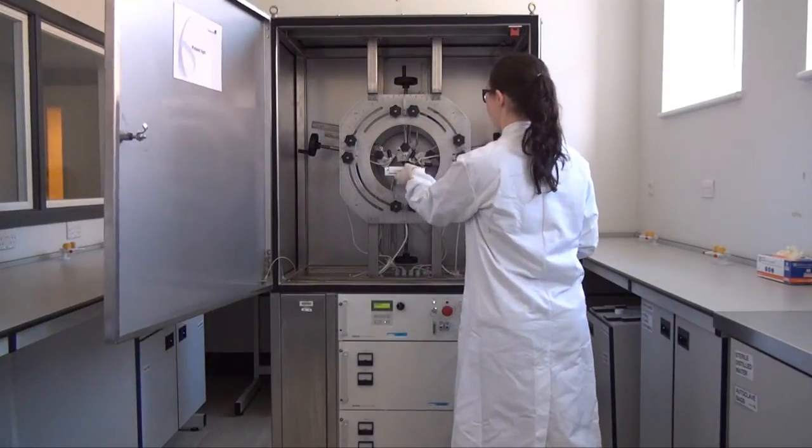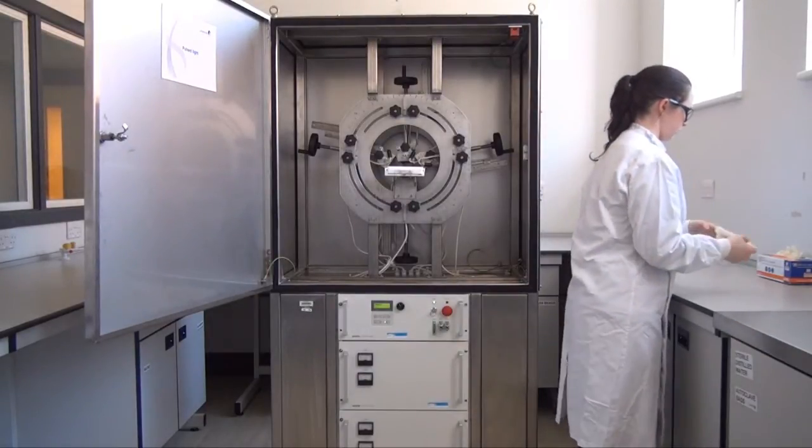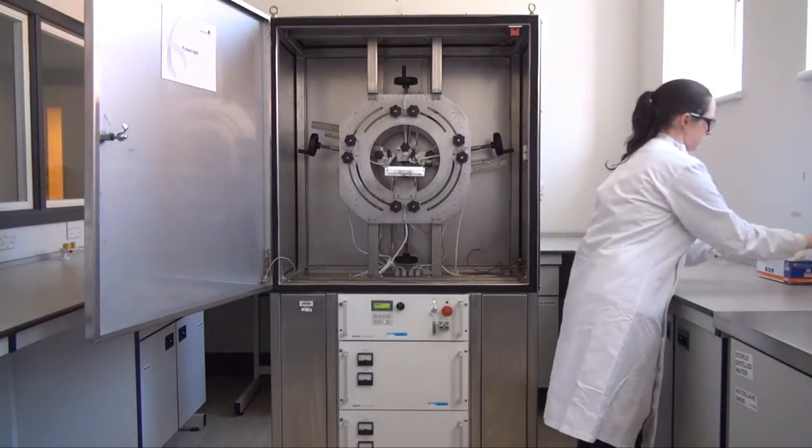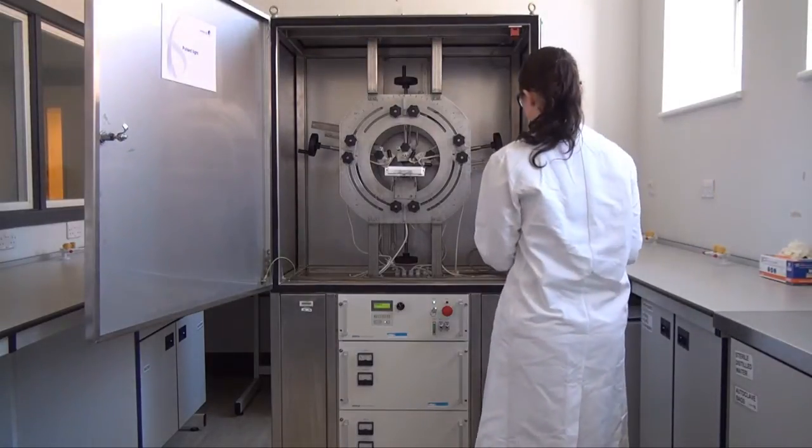In tests on stainless steel coupons using pilot scale kit at Camden BRI, up to 6 log reduction in microbial count has been observed with the treatment of a single pulse.